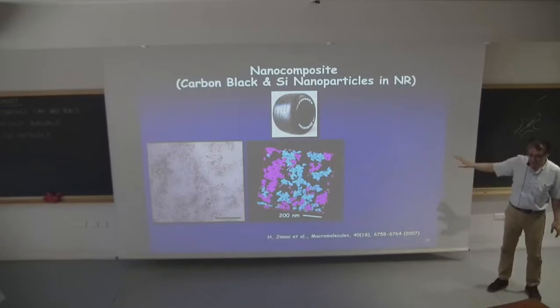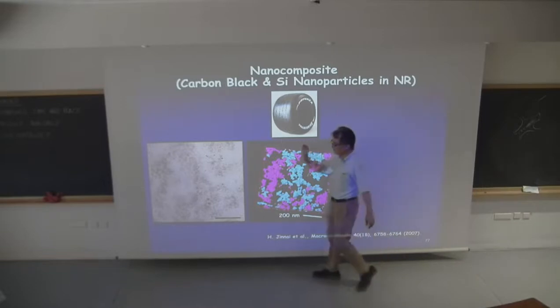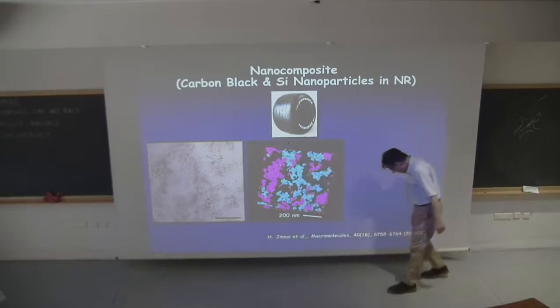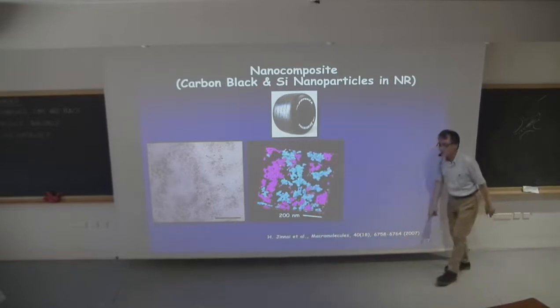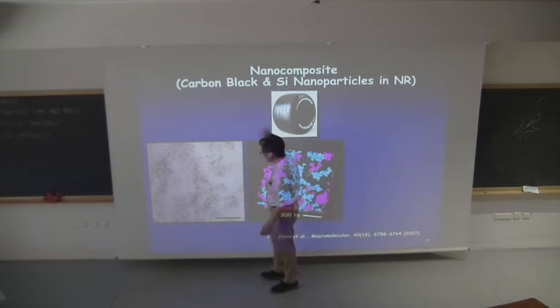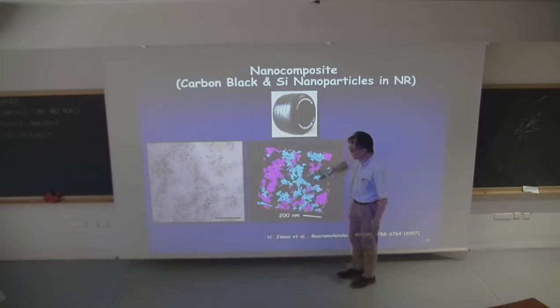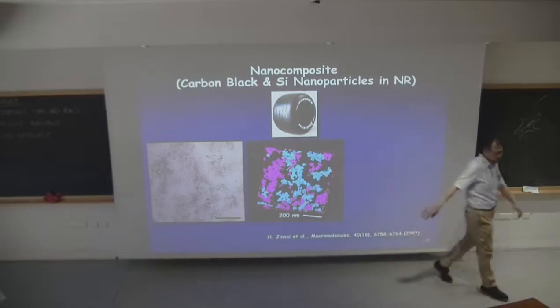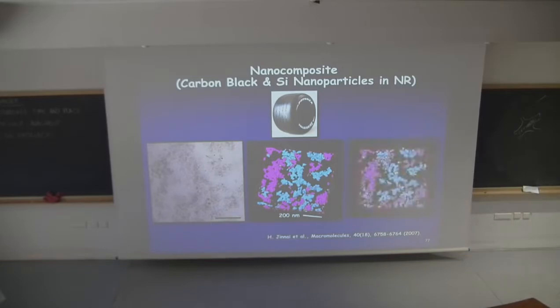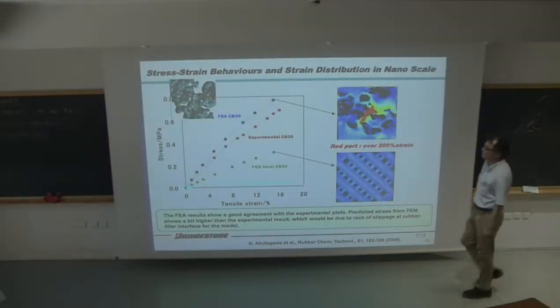So the point I want to make is that, up until something like 2007, 2000-something, people in this area were using this TEM picture for structure analysis. And with the tomography, we can have an additional dimension. And how are we going to use this? Okay, how are we going to use this?